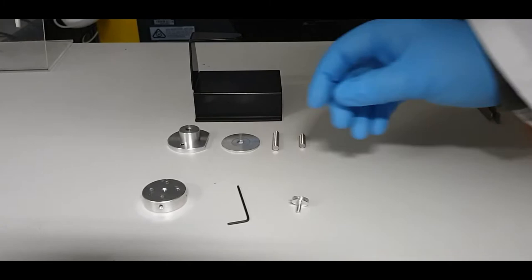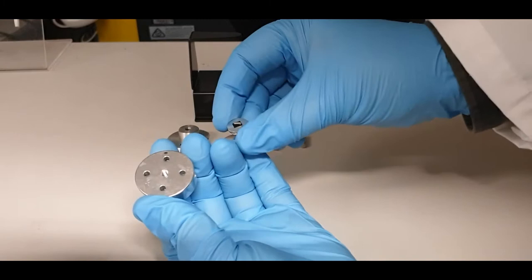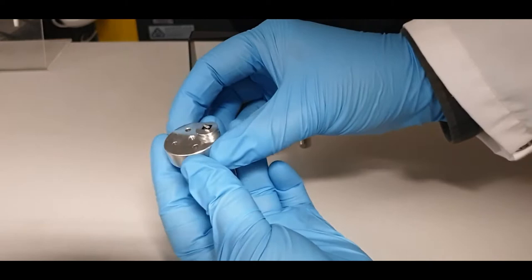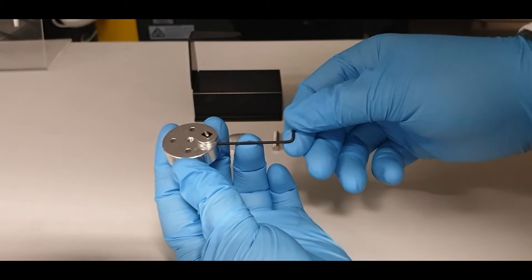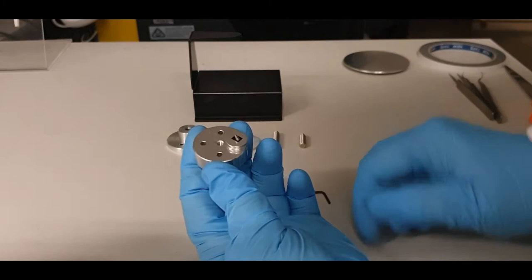To mount your sample using the pin stub holder, take the pin stub holder with your sample already mounted on a pin stub, drop it into one of the holes, and then with the allen key, insert it into the grub screw and gently tighten it until you feel resistance. Once you feel resistance, do not over tighten — just finger tight to make sure the grub screw holds onto the pin stub.